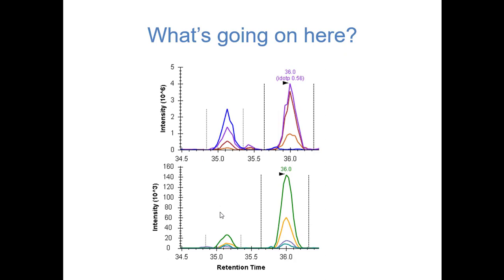For the fragment ions, these are the precursor ions. Again, this is pulled straight from Skyline. So the fragment ions actually look like they agree exactly, right? You get the green one, and then the yellow one, and then this blue, and then the purple one, and it's the same ordering here too, right? So they look like exactly the same peptide.